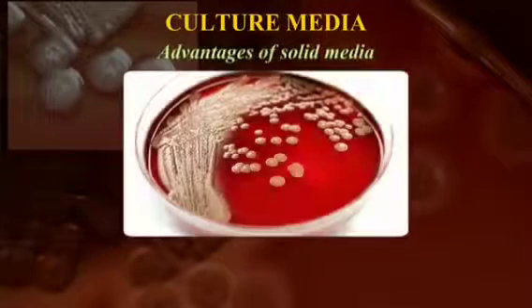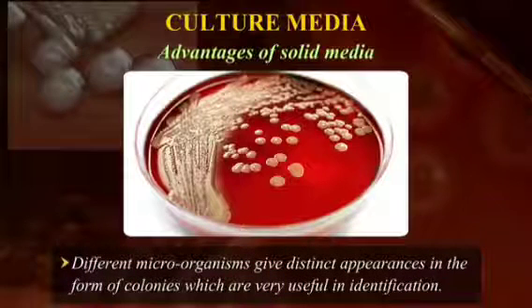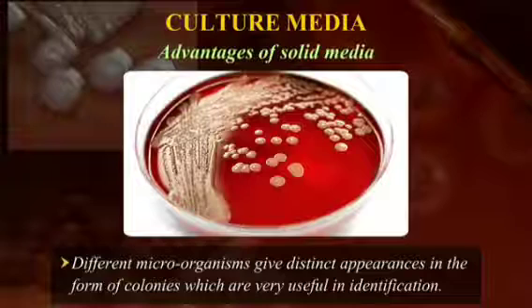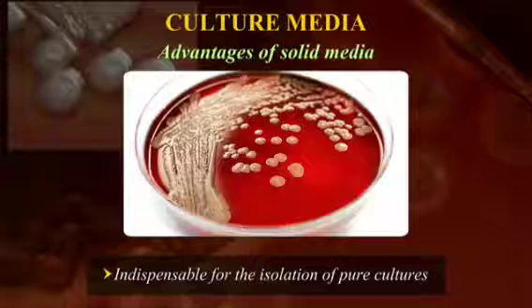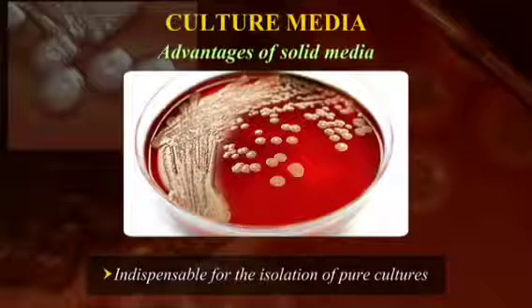On solid media, different microorganisms give distinct appearances in the form of colonies, which are very useful in identification. Also, solid media are indispensable for the isolation of pure cultures. That is, an organism can be easily separated and grown as a pure line, thus helping in identification.